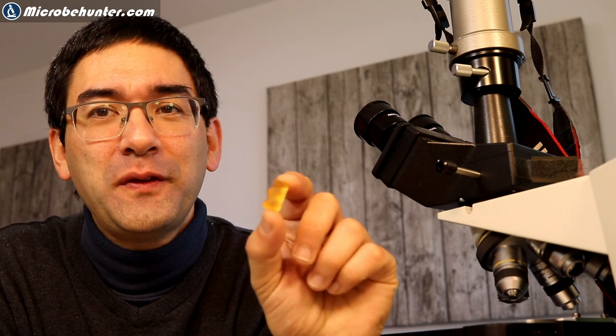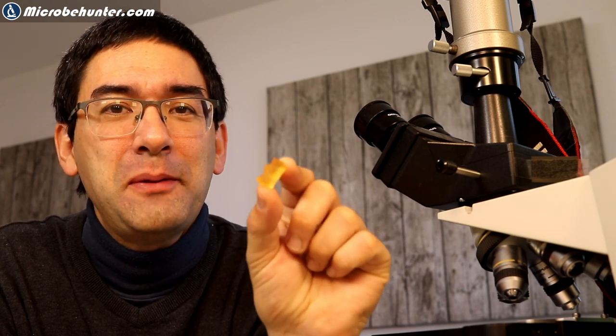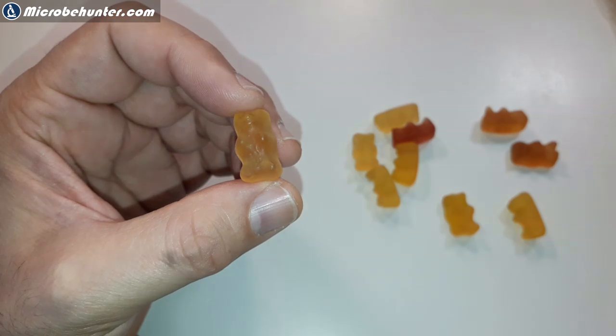Why are tardigrades called tardigrades? The word 'tardigrade' means 'slow walker,' because they walk slowly across the slide when you observe them. People also call them water bears because they apparently look a little bit like bears — and as a matter of fact I do think they look similar to these gummy bears I have here. Other people refer to them as moss piglets.